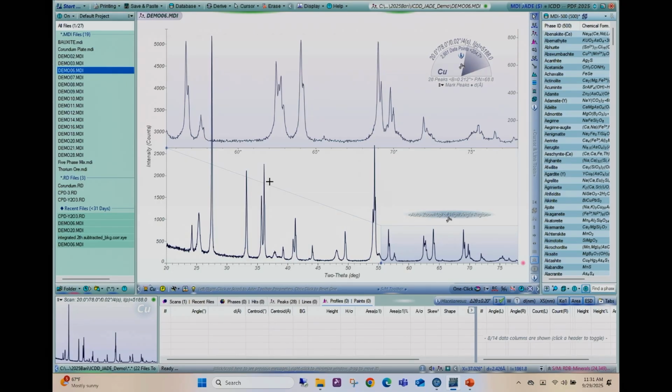So what happens in your software packages, it doesn't matter whose it is, they all do the same thing. They take the Powder Diffraction File database and they extract part of the data. They make an index file. They don't extract everything because it's big. And for phase ID, people want results now. They want to hit a button and they want the answer before they hit the button. I mean, people want to go quick, okay?